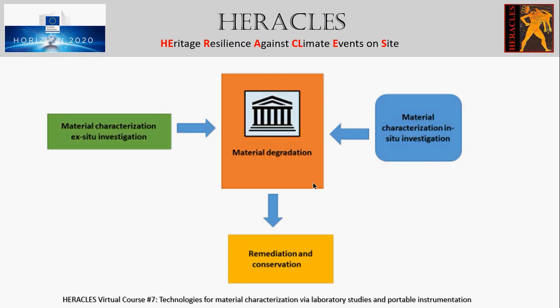So the diagnosis and analytical method, an ideal method for analyzing material of artistic or historic or archaeological nature, should be, as we know, non-destructive, that is, respecting the physical integrity of the material or object, should be fast, so that large number of similar objects may be analyzed, or a single object can be investigated at various positions on its surface.